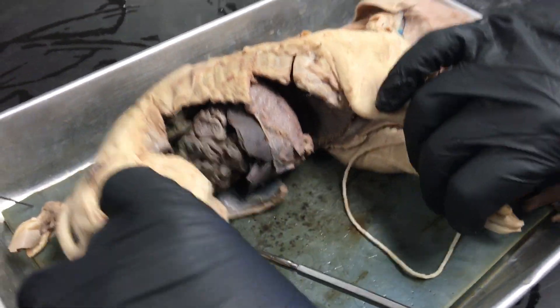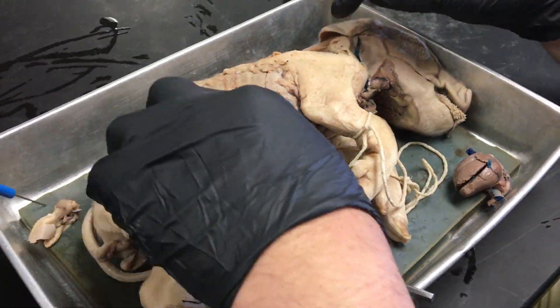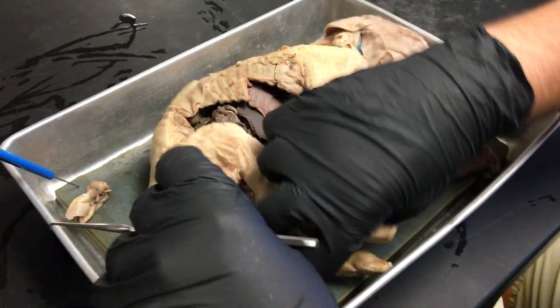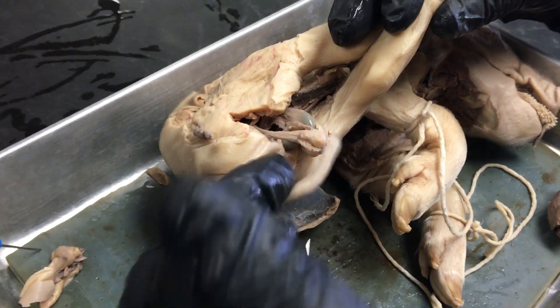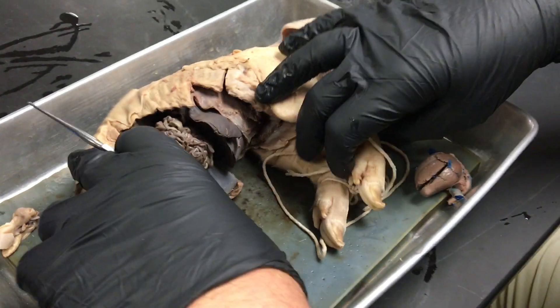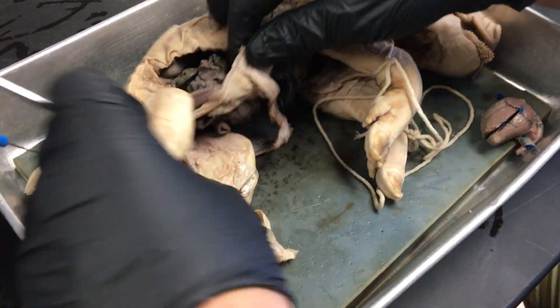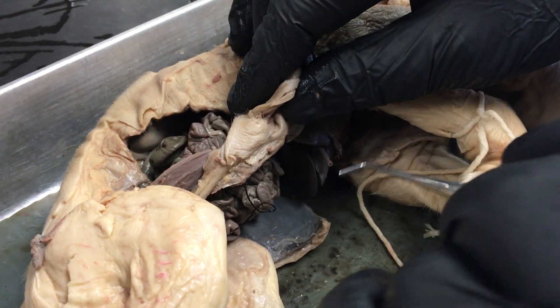Before we did this dissection we saw little nipples here called mammae. There's a mammae, and then on the outside of this male pig there's a scrotal sac remaining right here. This is the anus, and then we have the urogenital opening which was originally positioned right here — and there we can see it right there. Urogenital opening.